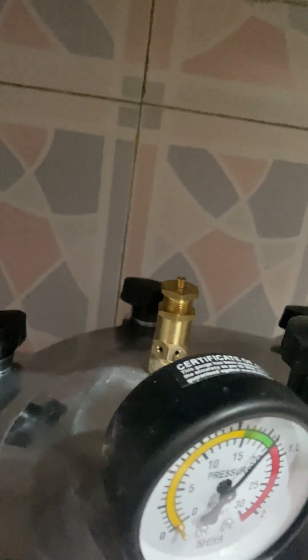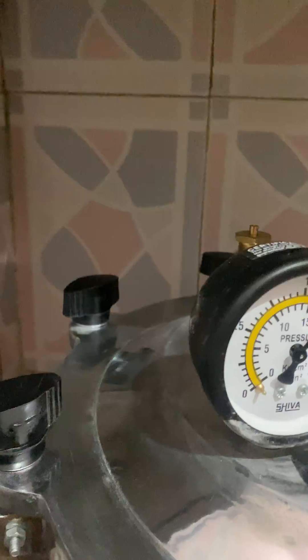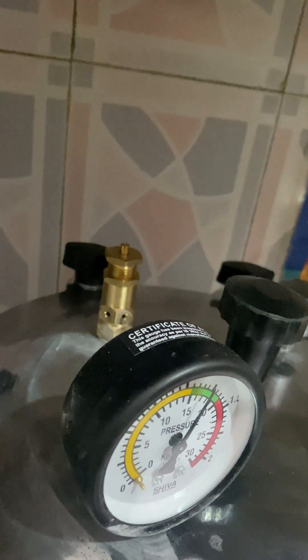On the top there is one screw — you can increase or decrease the pressure. If you loosen the top screw, the pressure will decrease, and if you tighten it, the pressure will automatically increase.